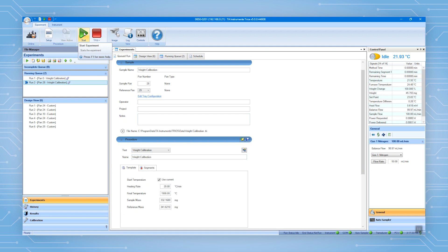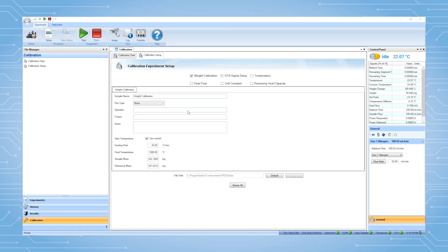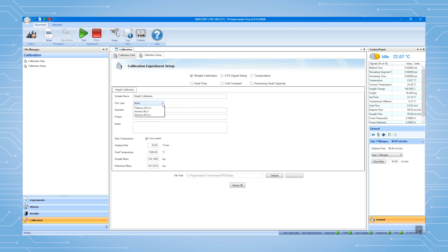If you don't have an auto-sampler, the setup will look like this. Make sure the pen type is none. The rest of the setup will be the same.